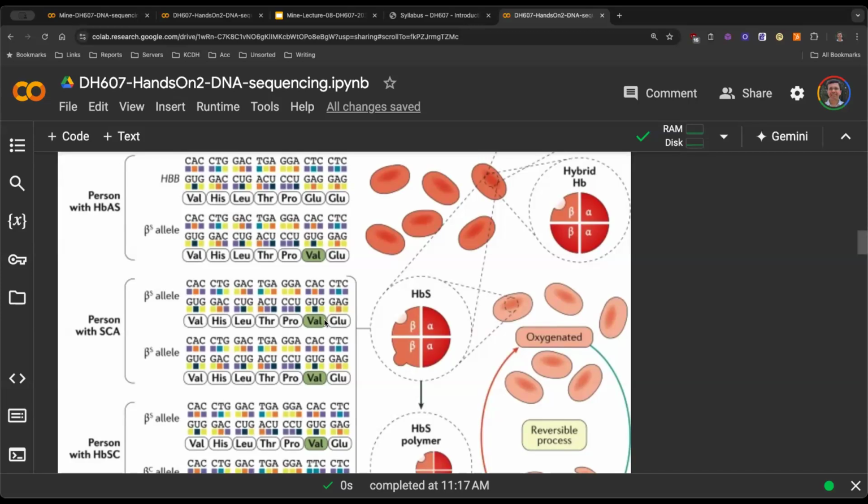For that data set, you do not have to do anything different. It just is slightly intensive. The total size of that particular data set is slightly larger, so we cannot run it on Colab, but if you download things on your laptop, you should be able to run it.